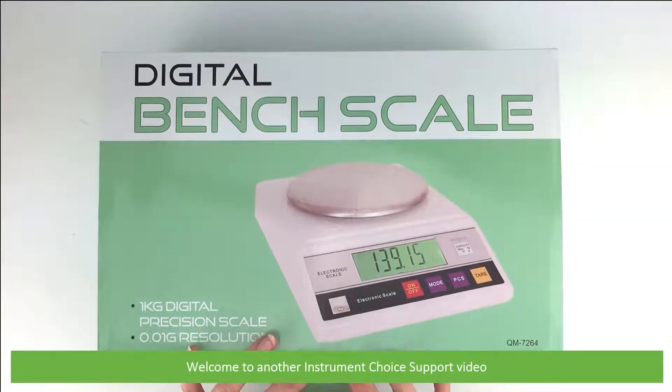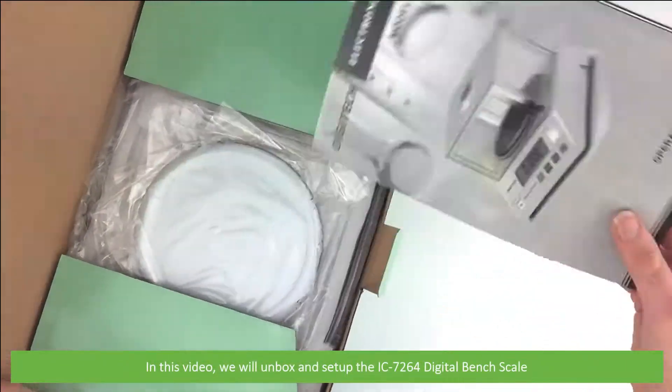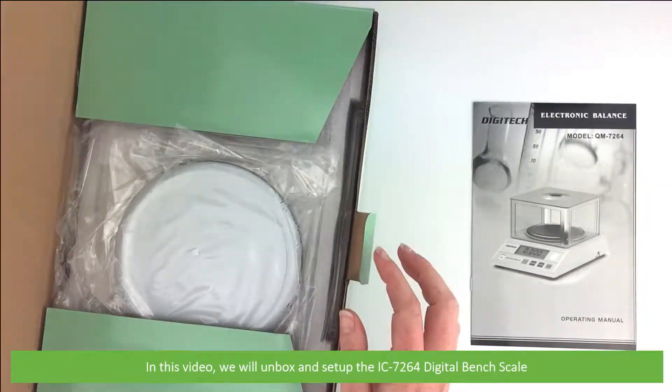Hi and welcome to another Instrument Choice support video. In this video, we will unbox and set up the IC-7264 digital bench scale.